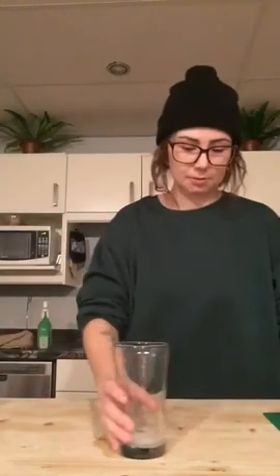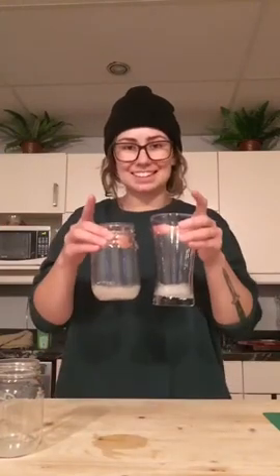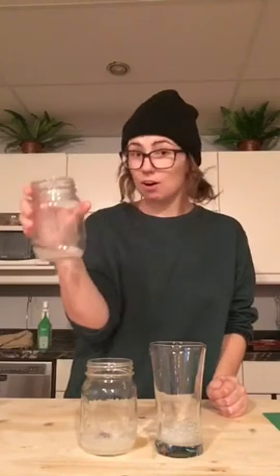So looking at all 3, that one actually put off quite a bit of heat, both of these. This one more. So the cold liver actually put off some heat. Sorry, I don't have all 3 glasses. But it's actually reacting quite a little bit more than the warm liver is. The warm liver is not reacting as much as I thought it would, not really putting off a little bit of heat. And then the boiled liver basically has not reacted at all.